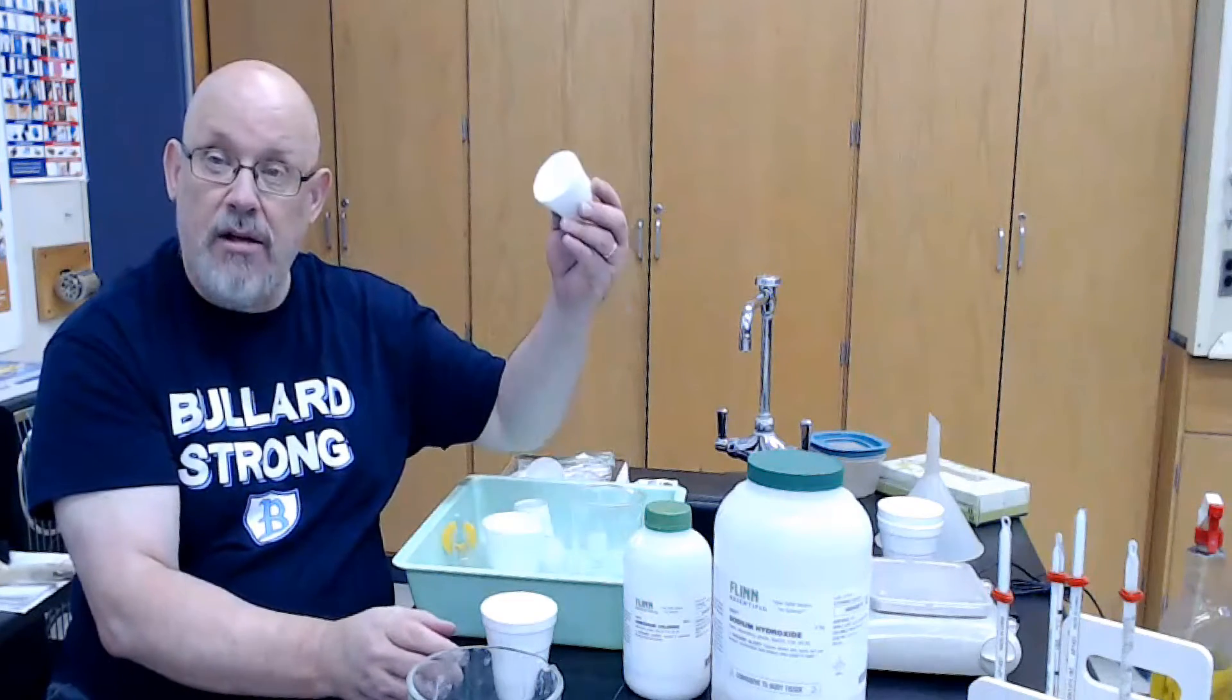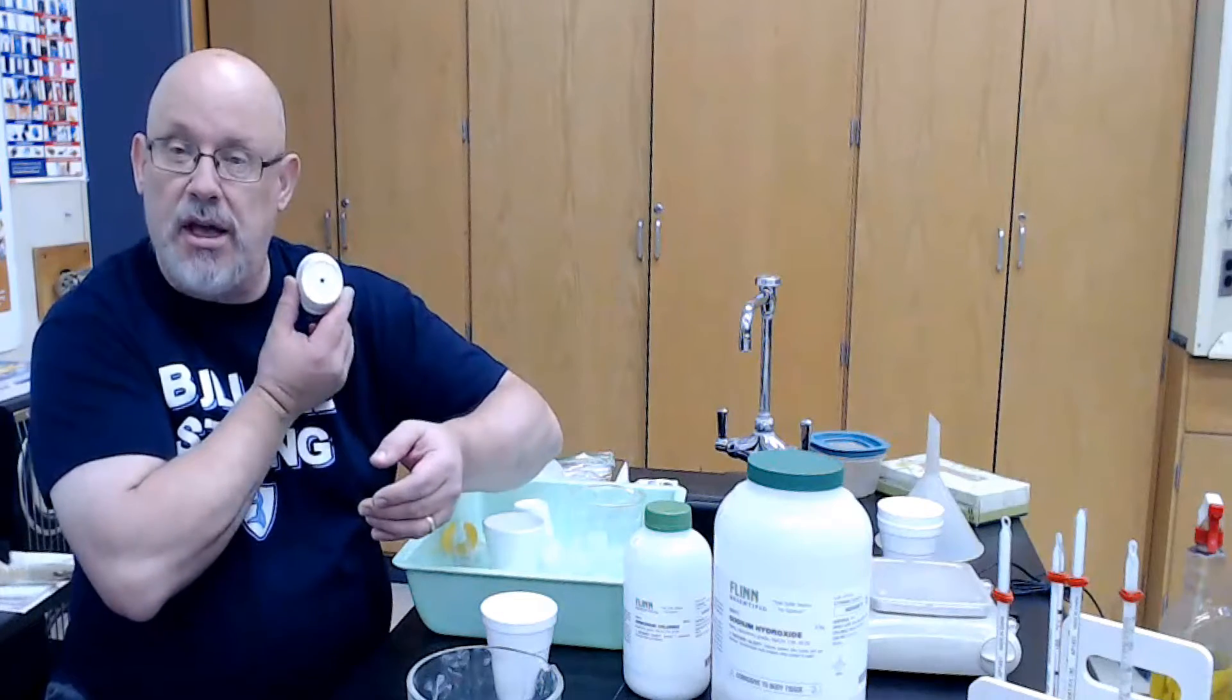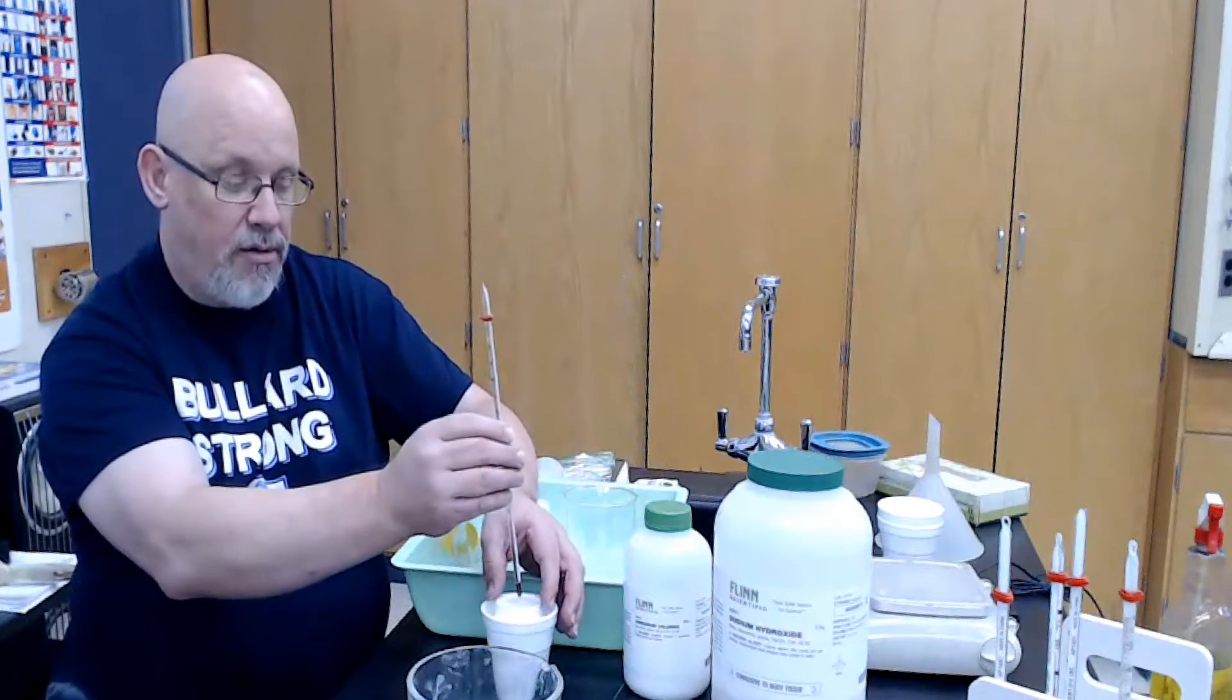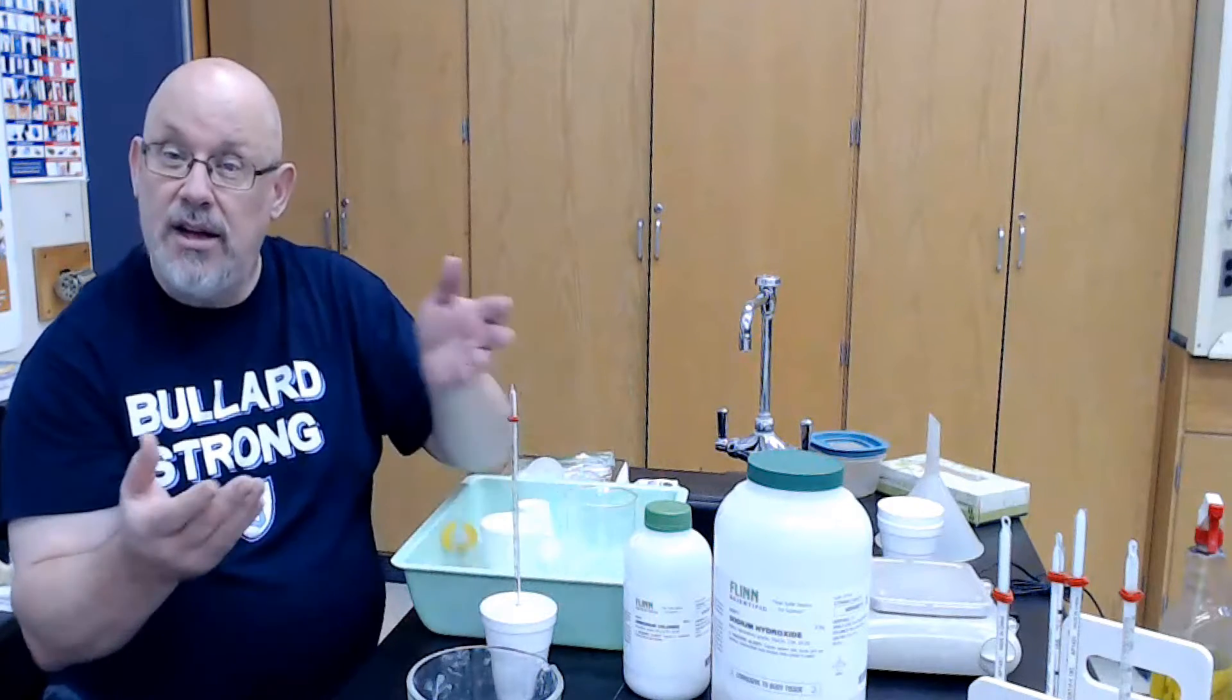The top of the calorimeter is another piece of a foam cup that's been cut short. And it has, as you can see, a little hole through which we can thread a thermometer. Now, before we do the reaction, we would measure the temperature of the water, the starting temperature, T sub i, the initial temperature.